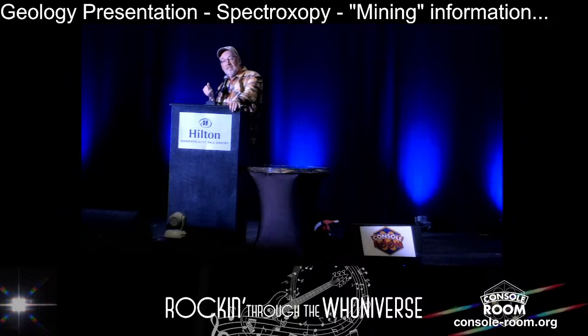cell dimensions of that particular mineral, and you kind of need specialized equipment in a lot of cases for that. We don't have that specialized equipment. Single crystal X-ray diffraction, for example, would be an important piece of that information. But you have to do some really good science and really good measurements to be able to name a new mineral species, for example.